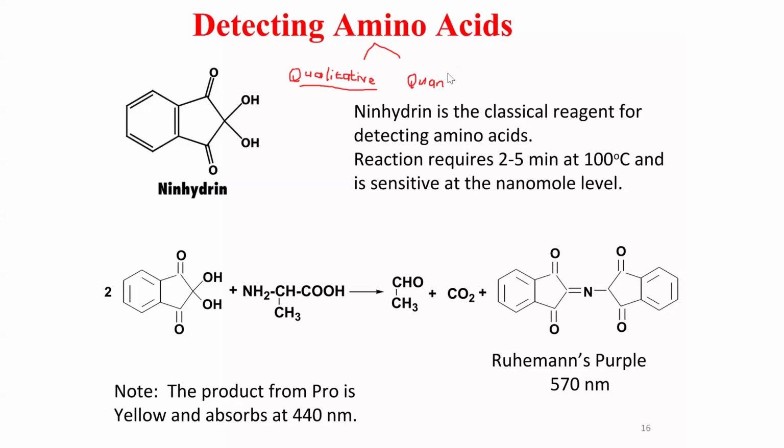So assuming you are given a solution. Generally in a hospital, you do this. If you have a patient, maybe you want to check whether the patient has malaria or not. To check the presence or absence of malaria in a particular patient is what we call a qualitative test.